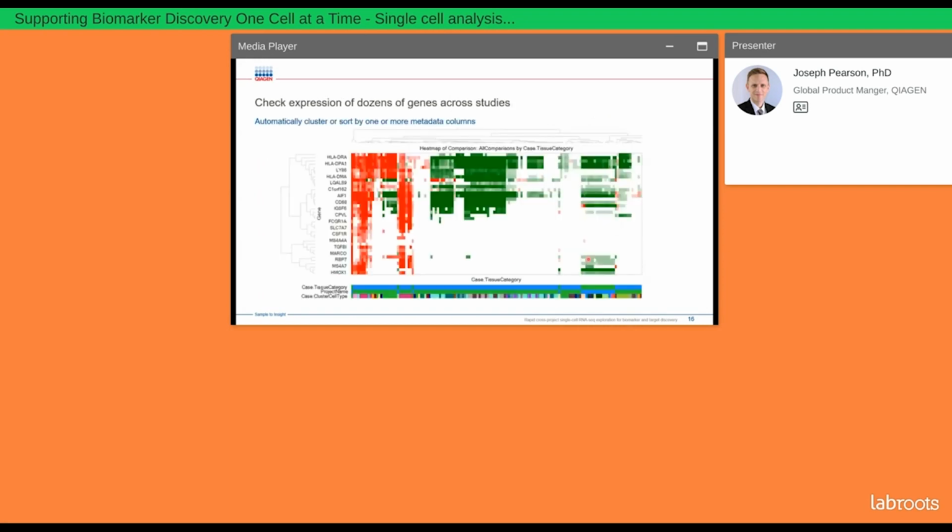You can take this analysis even further and search for dozens of genes and explore, for example, the upregulation and downregulation pattern of signatures for macrophages across all of the different statistical comparisons and look for those patterns of expression of upregulation or downregulation in different data sets across the different projects, across the different tissues, and across the different cell types. So you can identify specific patterns and you can make unexpected discoveries about expression patterns in cell types you may not have even expected.